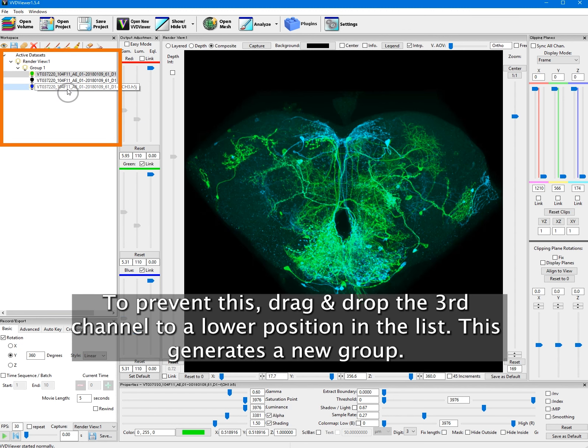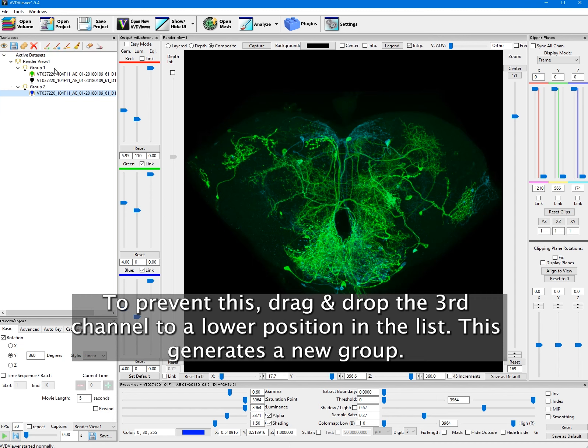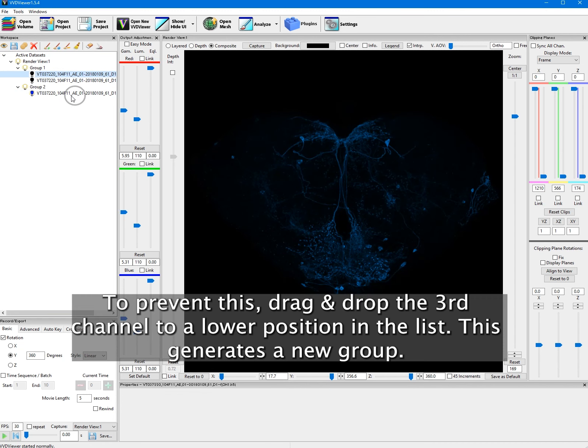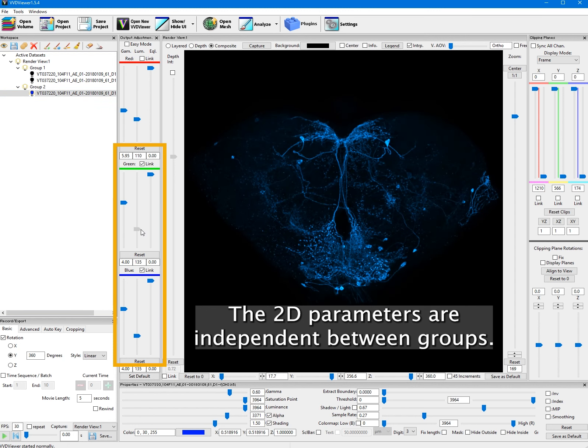To prevent this, drag and drop the third channel to a lower position in the list. This generates a new group. The 2D parameters are independent between groups.